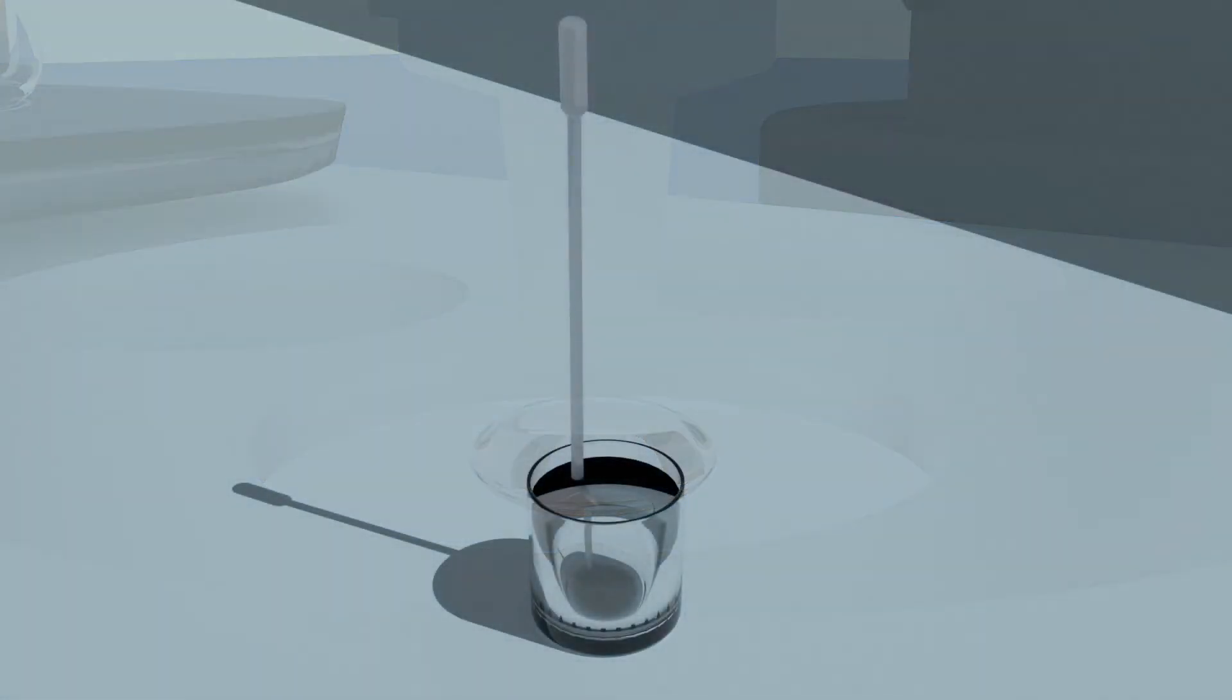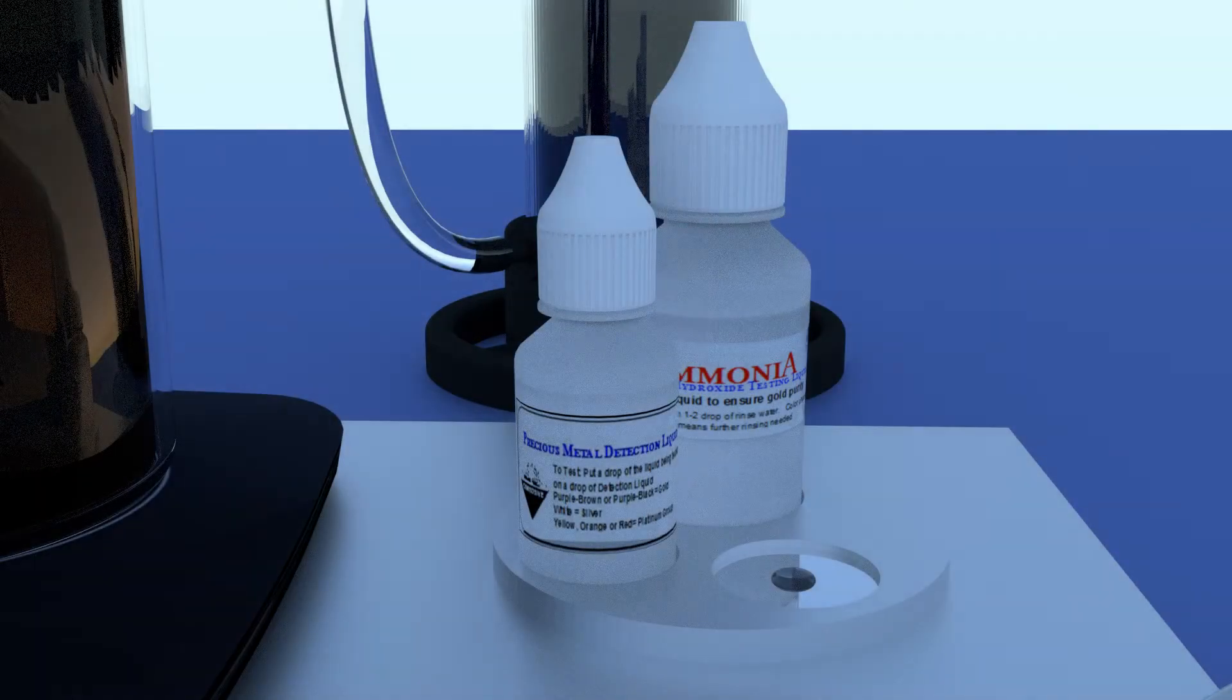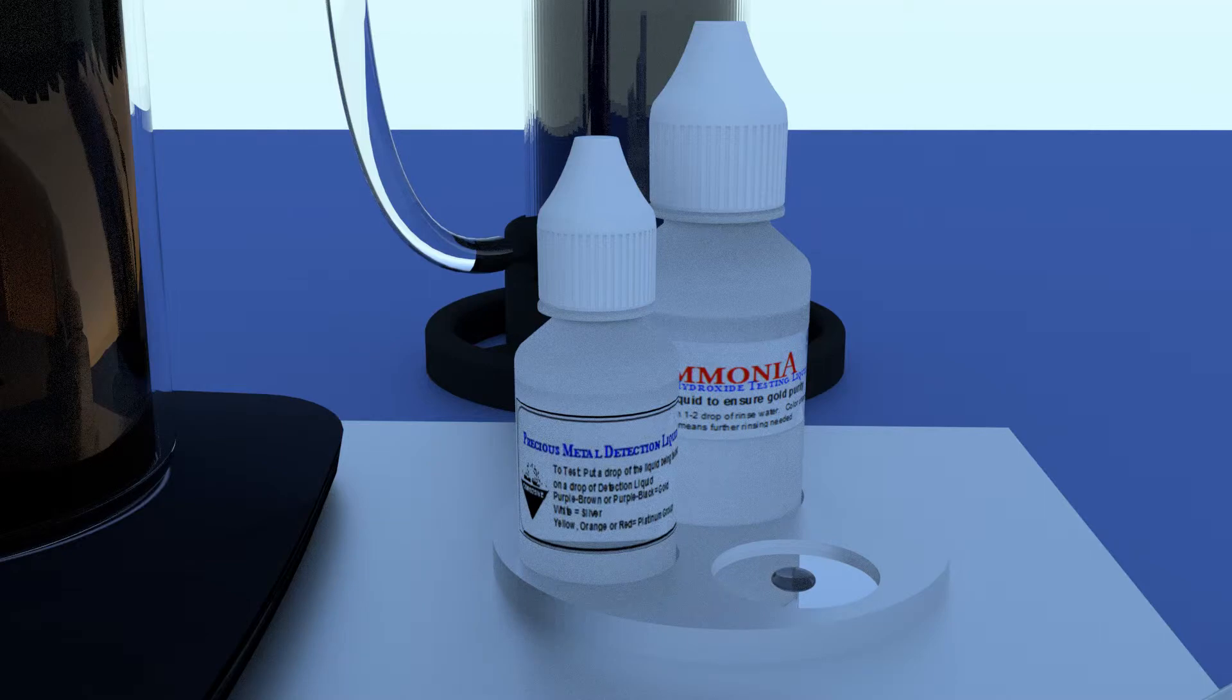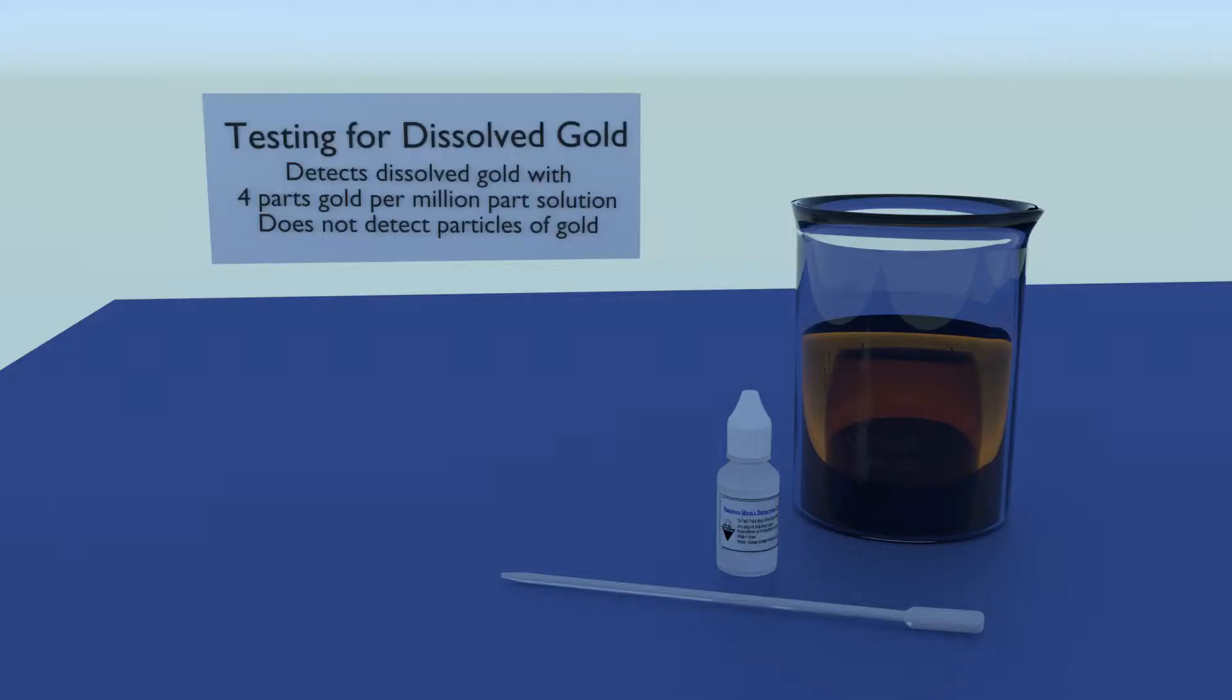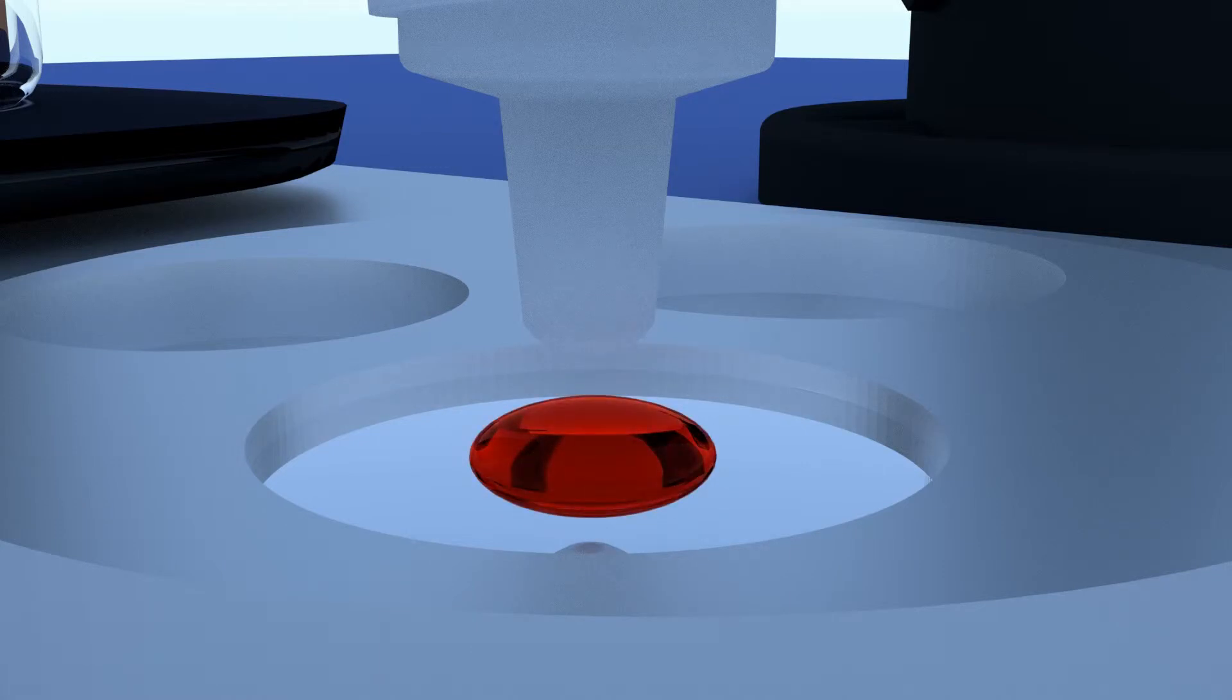You can run this test as often as you like. Just be sure to clean the pipette inside and out between tests. Cleaning ensures that you don't get a false positive. This test is sensitive to within four parts of precious metal per million parts of solution, and it will also detect dissolved platinum group metals with different color changes for different precious metals.